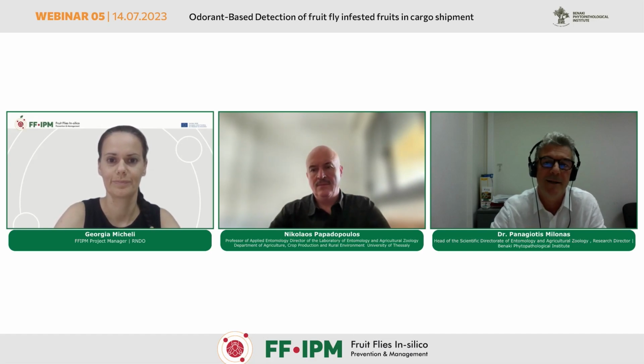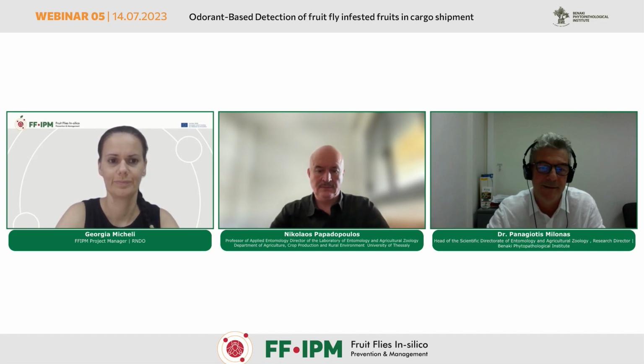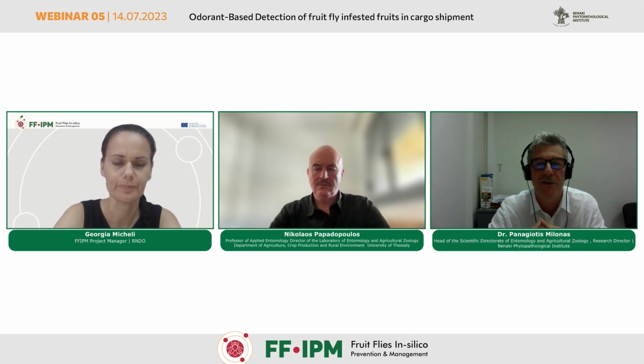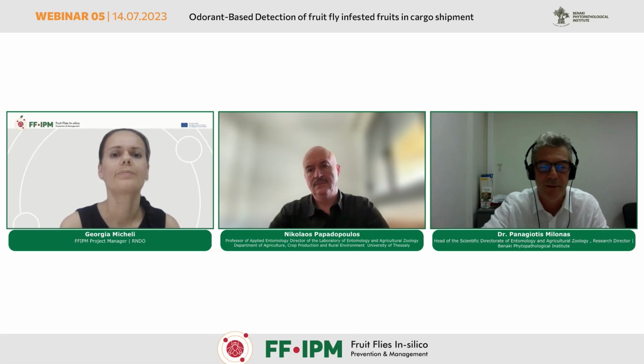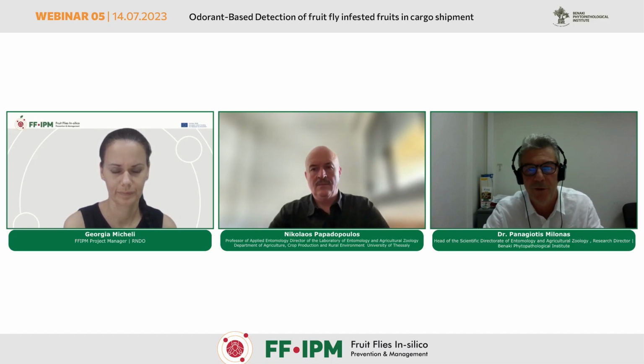And so this is something that we will do in the near future. And this is how the inspector will use it in practice. Actually, this is how it's used when they are used for commercial reasons, as I said, for regular inspections to see the quality of a product. So at this time, this specific equipment, this is how it is used. They wrap even a pallet, and they take a sample of air from the pallet to see if it's in one category or another.